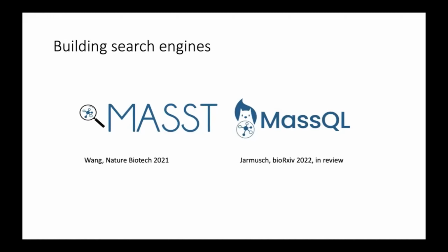And so now you can build search engines. The first search engine that we built was MASST. It may sound familiar, it sounds like BLAST, and that's because it serves a very similar purpose. When you go to NCBI, you do a BLAST. In BLAST, you can paste a protein sequence, an RNA sequence, or a DNA sequence, and you can find all the other data sets that have been deposited in the public domain that have that same sequence or analogs of it, in other words, mutations and splice forms. So you do it based on sequence alignment.